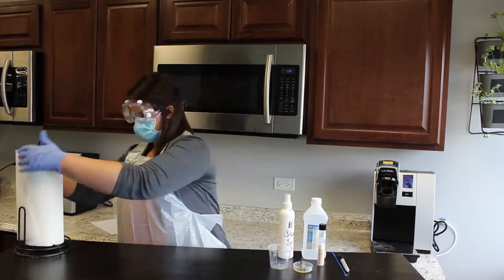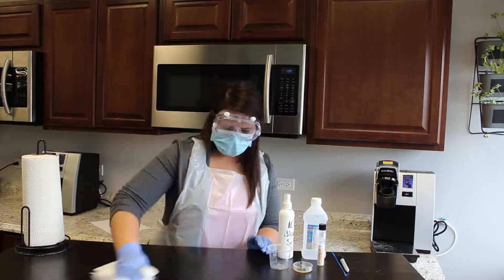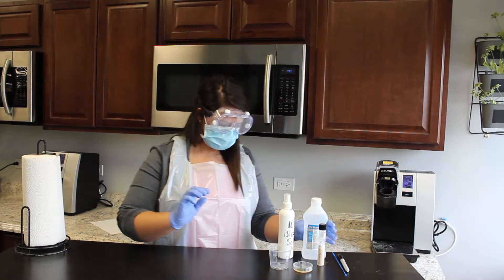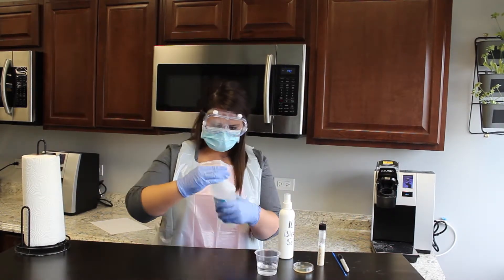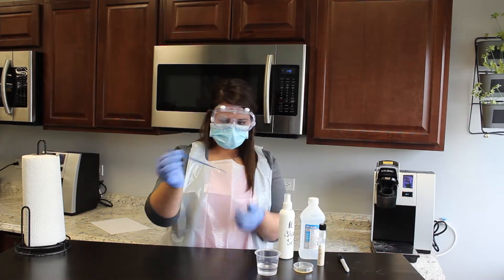Wipe down work surface with 10% bleach solution. Pour isopropyl alcohol into a plastic cup. Place the inoculation loop into the beaker of alcohol.